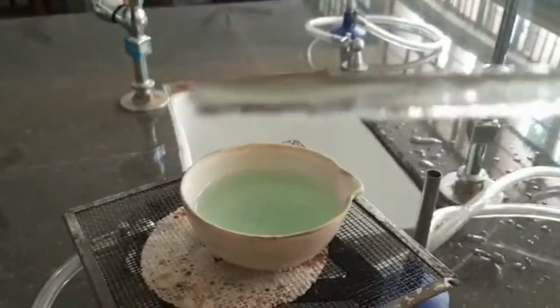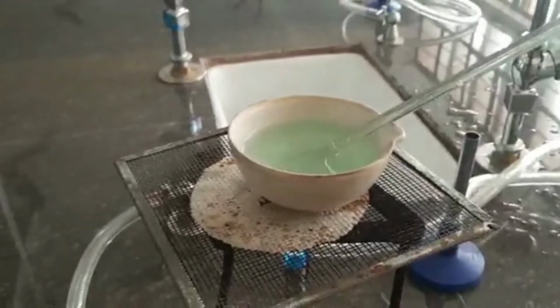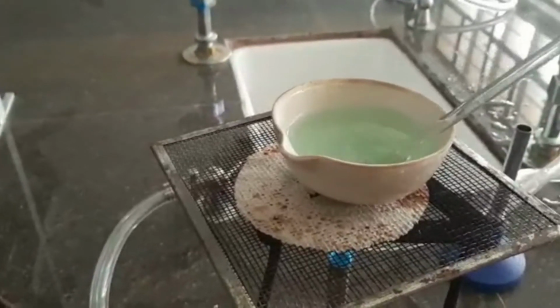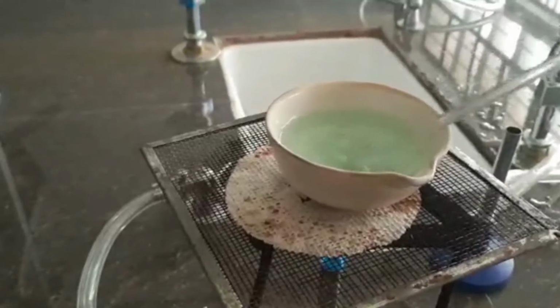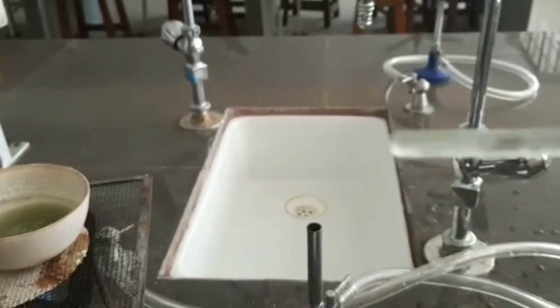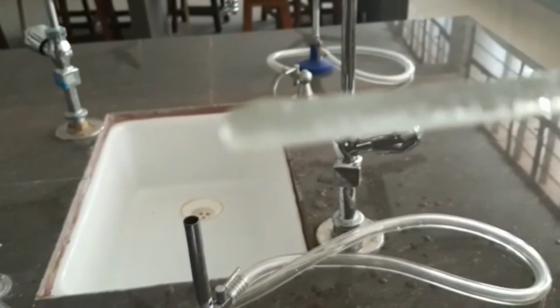When crystals are seen on this rod, it means crystallization point is reached, and we will stop heating it further. Avoid overheating of the solution, because if the solution is overheated, it will result into a solid mass and we will not get nice crystals. Now just check the crystallization point. You can see the glass rod now has crystals. So this shows crystallization point has been reached.